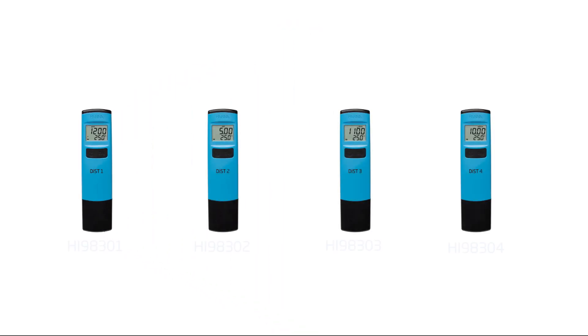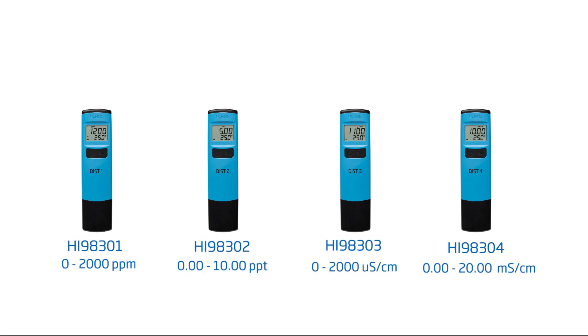There are four meters in the DIST family, including a low and high range version for both connectivity and TDS. All four meters operate in the same fashion, with the only differences being the measurement range and the standard used for calibration.